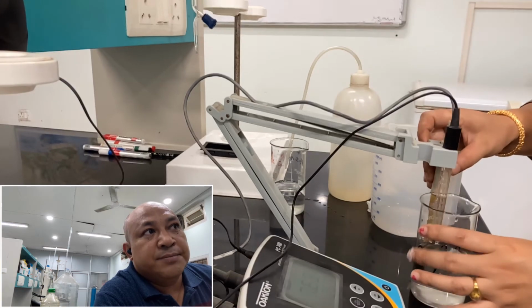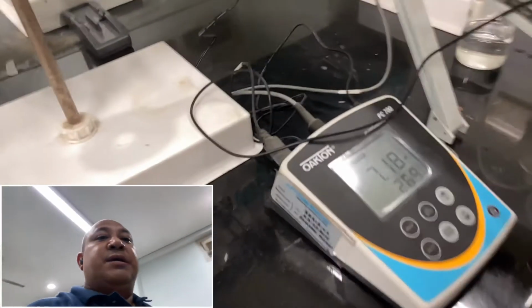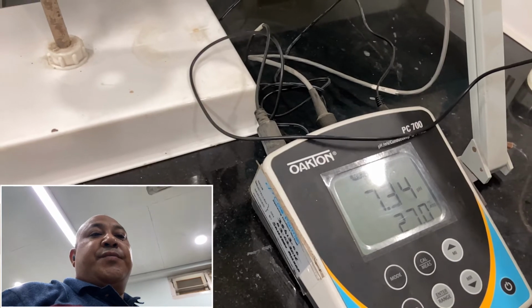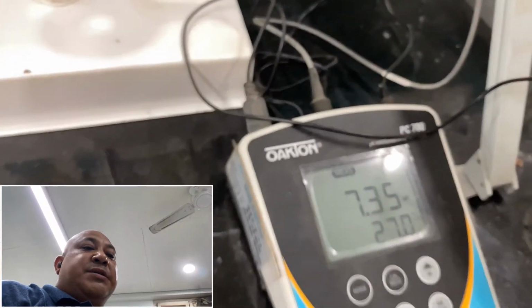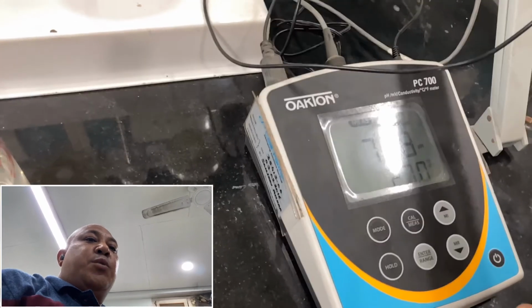Is it a new one? Okay. Now let's see the pH. Is it a new one or an old one? This one is the old one.